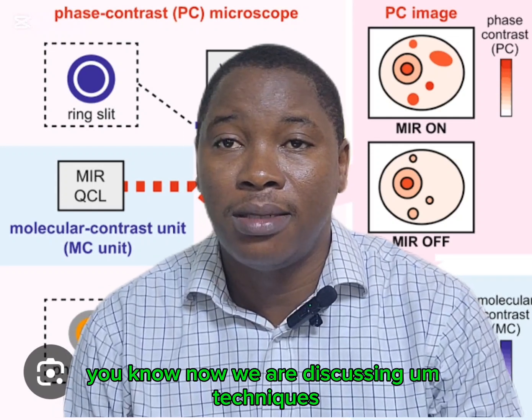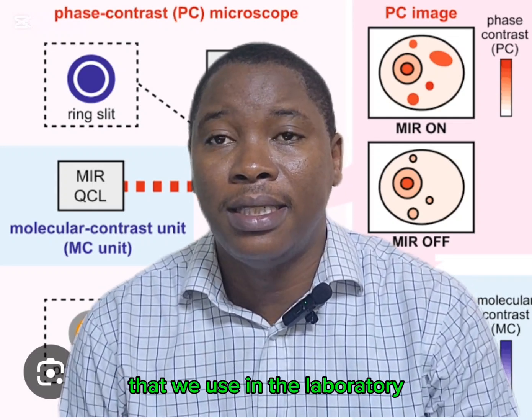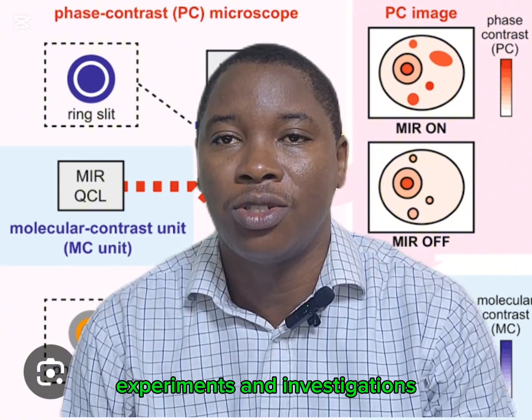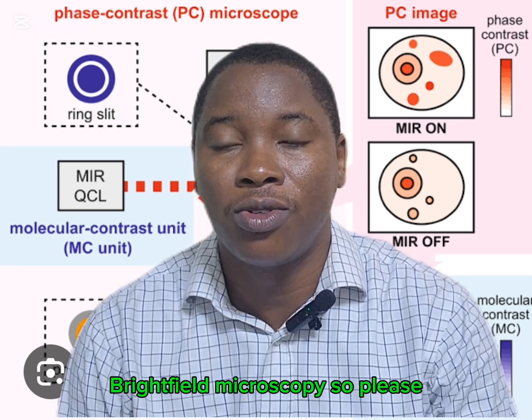Now we are discussing microbial techniques that we use in the laboratory in order to carry out our different experiments and investigations. We have a video where we have spoken about bright field microscopy.